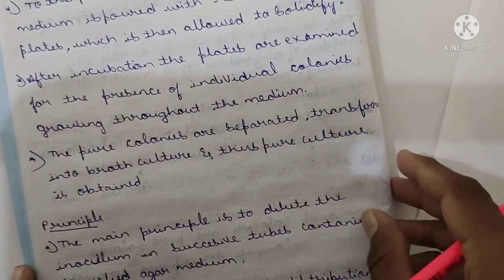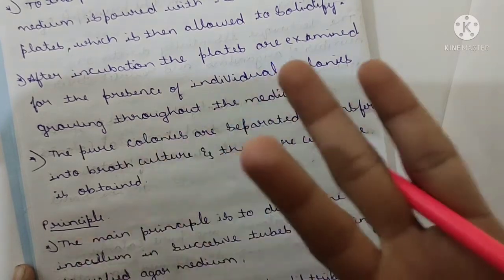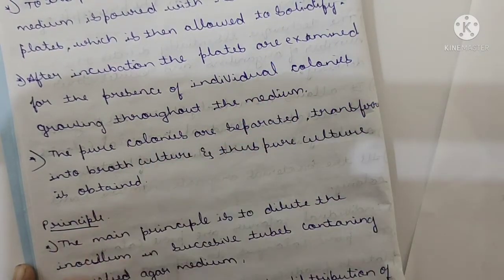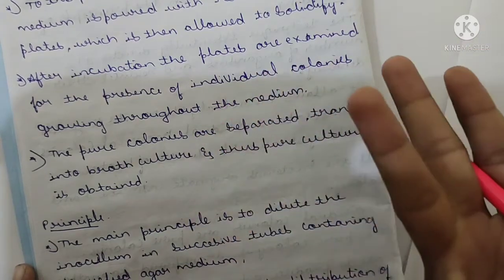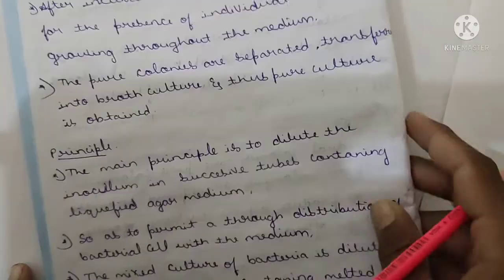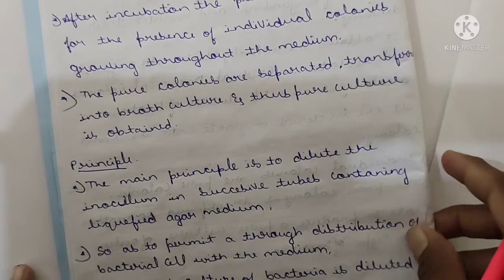Now the pure colonies are separated and transferred into broth culture, and thus a pure culture is obtained. Yes, we will separate those pure colonies and transfer them into the broth culture, and thus the pure culture is obtained. You will get all these points when I explain the procedure. Don't worry. Yes, let's study the principle.